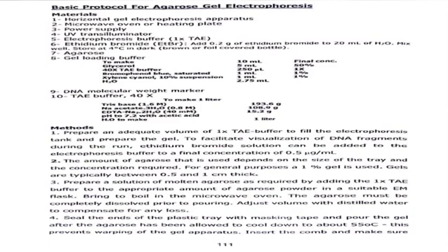Tris base (1.6 M) 193.6 gram, sodium acetate 3H2O (0.8 M) 108.9 gram, EDTA sodium 2H2O (40 mM) 15.2 gram, pH to 7.2 with acetic acid, H2O to make 1 liter.